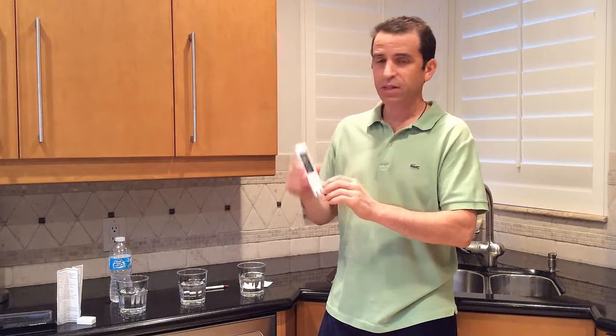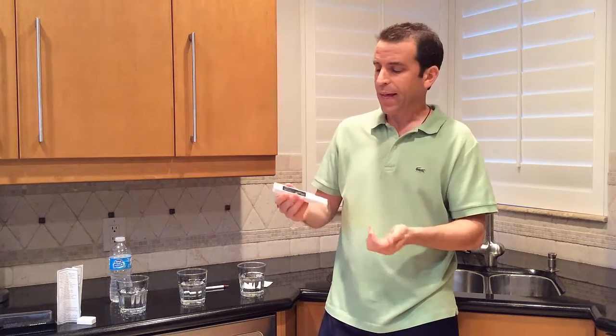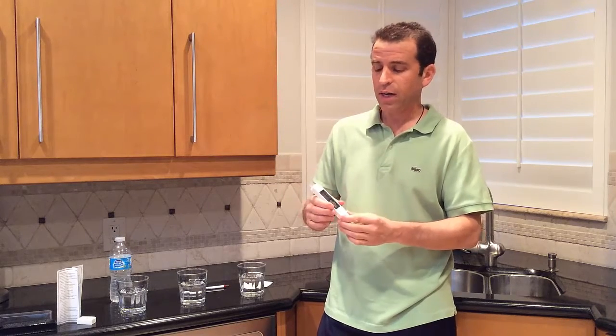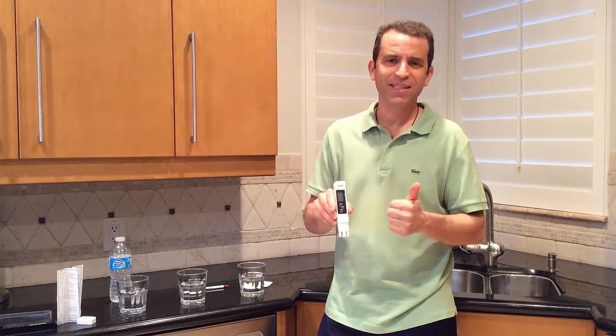Just when I thought my filter water would do much better than tap water for filtration and quality, I don't know — I'm going to have to rethink things about the filter I'm using. As you can see, this gives a very quick reading. It's a fun way to test your water or your friend's water. The product is very affordable and lightweight, something you can use for many years — and it makes a great gift too. It's so important to drink healthy water, so make sure you test yours. Have a great day, and most importantly, drink quality H2O.